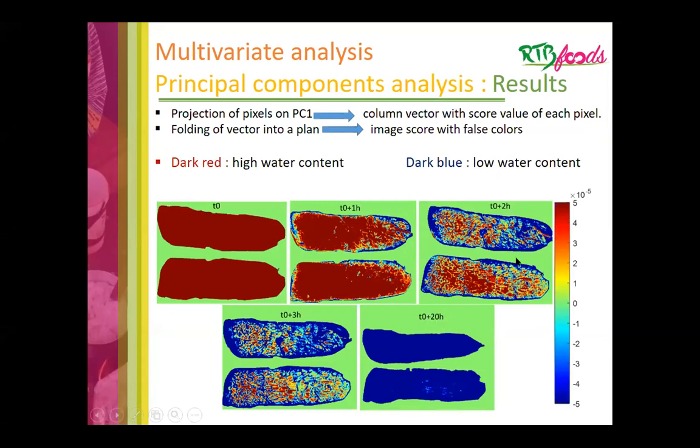We see also at 2 hours after drying a heterogeneous increase of the dried part in blue. And at 3 hours after drying, the dried part is more than the wet part. The remaining wet part is more concentrated at the fiber level.